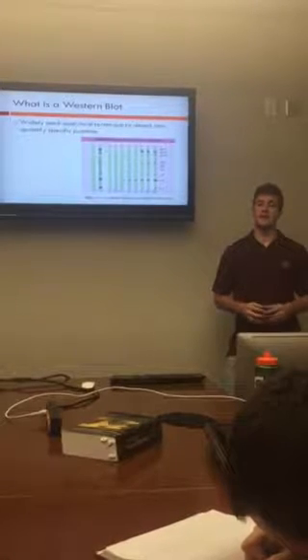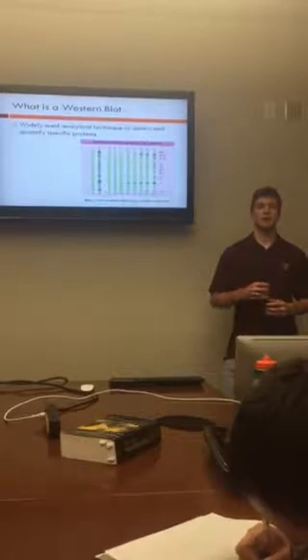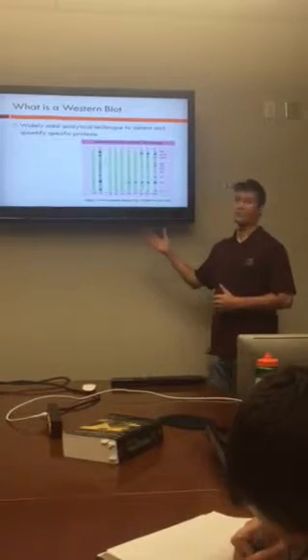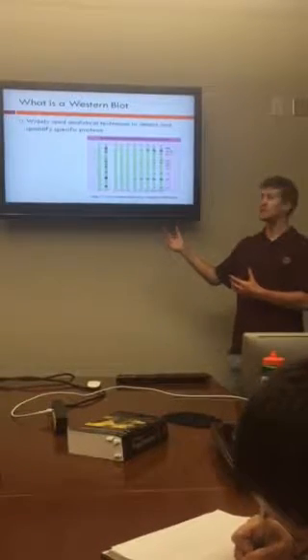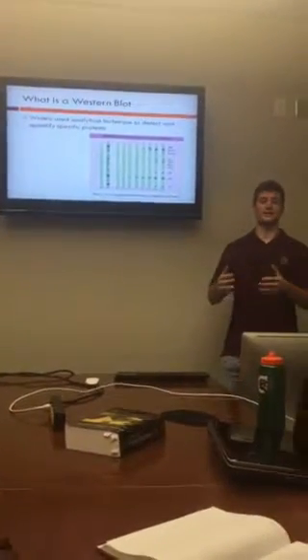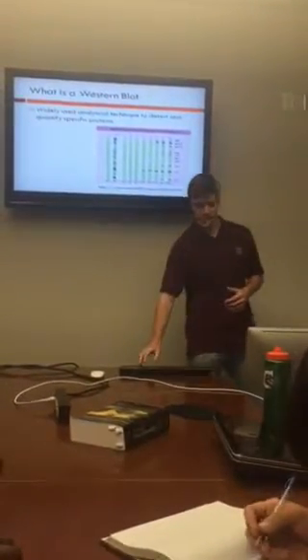So the first thing is, what is a Western blot? A Western blot is a widely used analytical technique used to identify and quantify protein. And here I have an image of what a sample Western blot would look like once you finish. This is actually a Western blot used for identification of HIV in a patient.